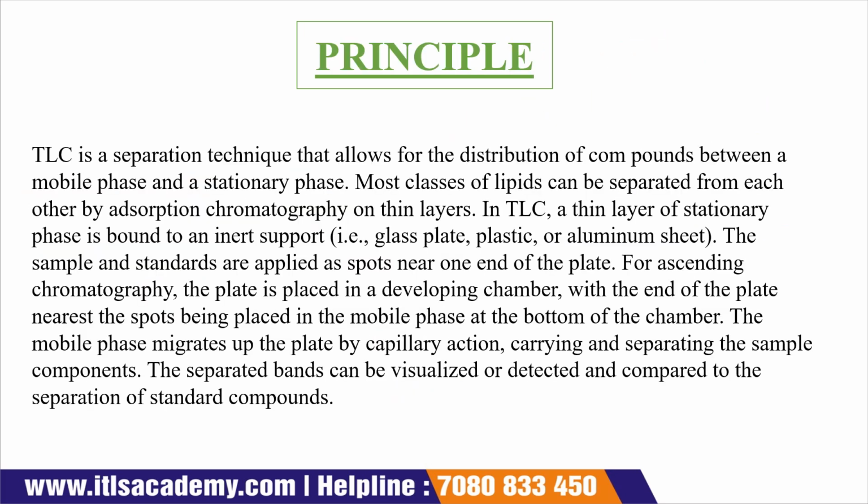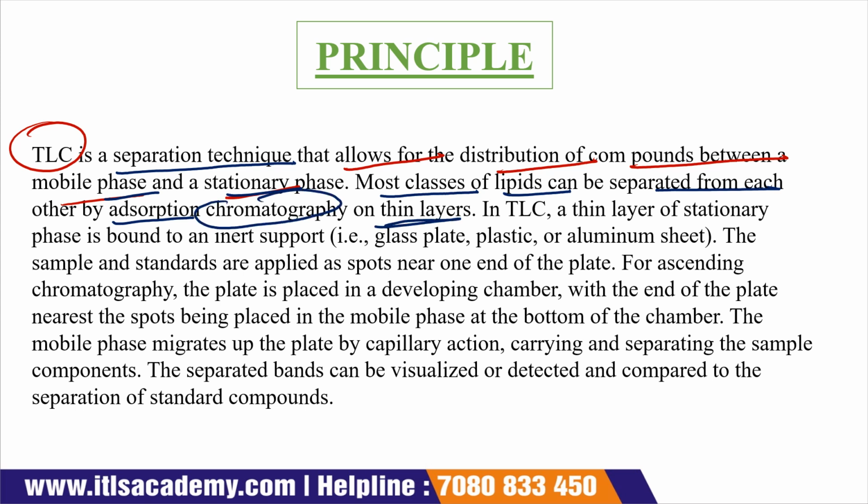TLC is a separation technique that allows for the distribution of compounds between a mobile phase and a stationary phase, which I already told you. TLC is a separation technique which separates the compounds between the mobile phase and the stationary phase. And most classes of lipids can be separated from each other by adsorption chromatography on thin layer.